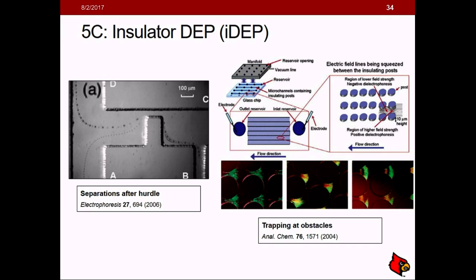So particles that are focused and come in are ultimately repelled, at least the larger particles are repelled, because recall that the dielectrophoretic force is proportional to volume. So the larger particles are repelled from these regions and then ultimately will divert to another channel.